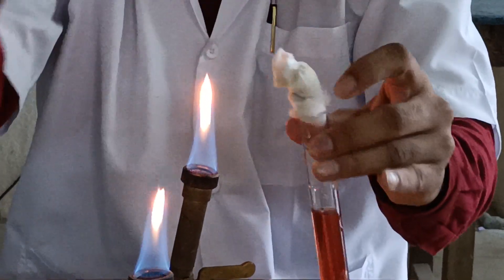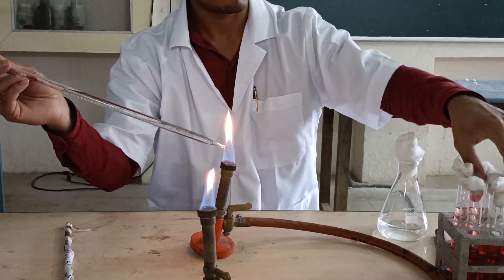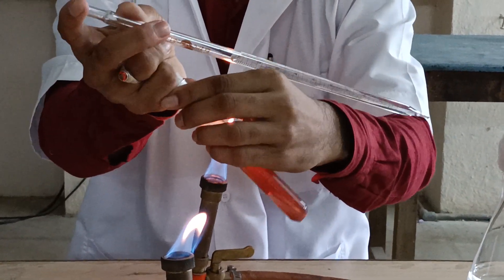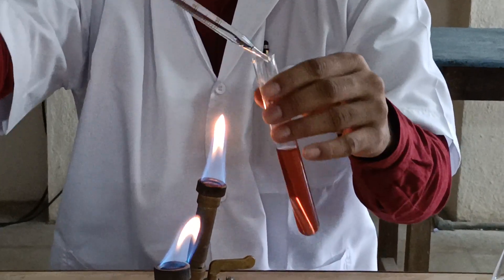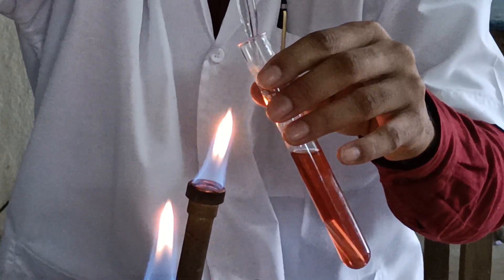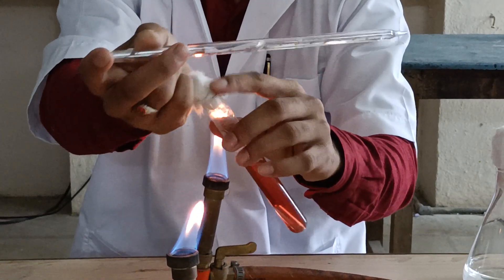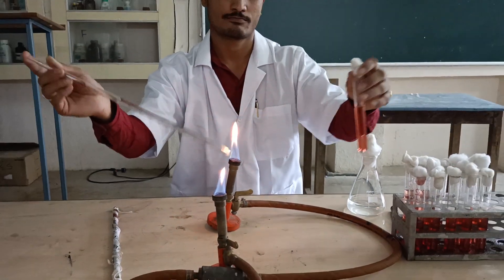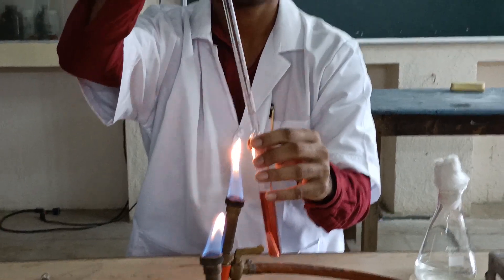The inoculation is done aseptically and we gently shake the test tube. Vigorous shaking is not allowed because that will create formation of bubbles. Care should be taken that bubbles should not be formed into the test tube. In this way we inoculate the remaining test tubes with 1 ml of the given water sample.